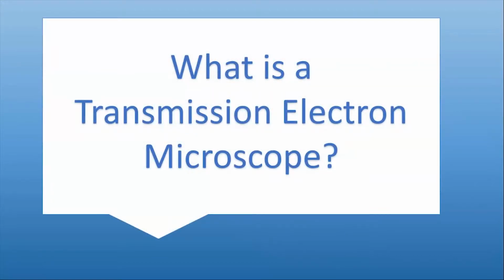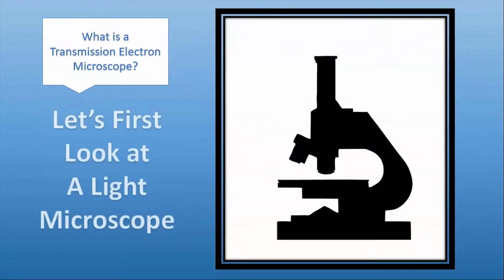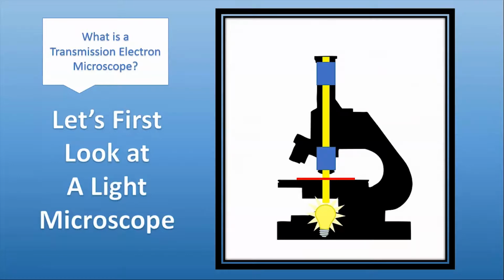What is a transmission electron microscope? First, we'll look at a light-operated microscope, where the light source at the base projects its light beam through the sample and lenses, magnifying it for the viewer above.